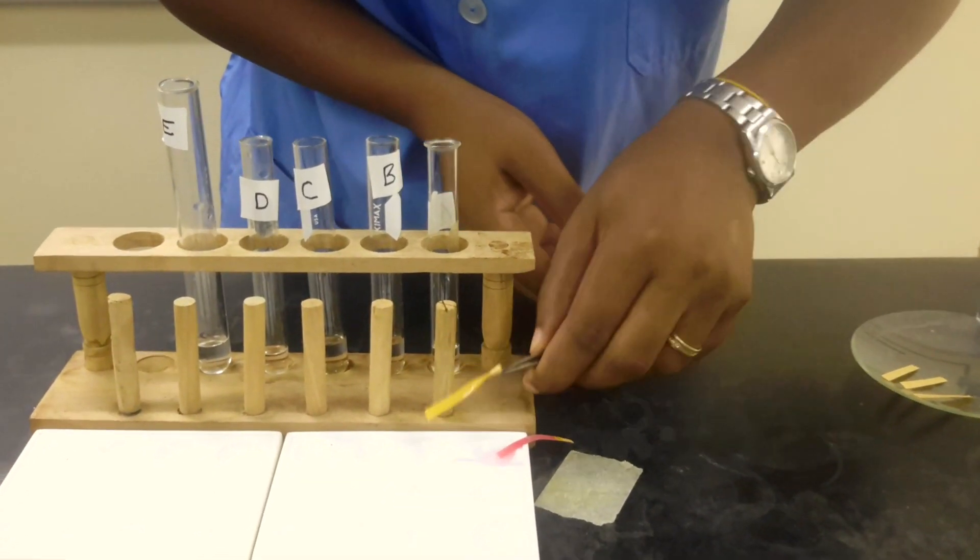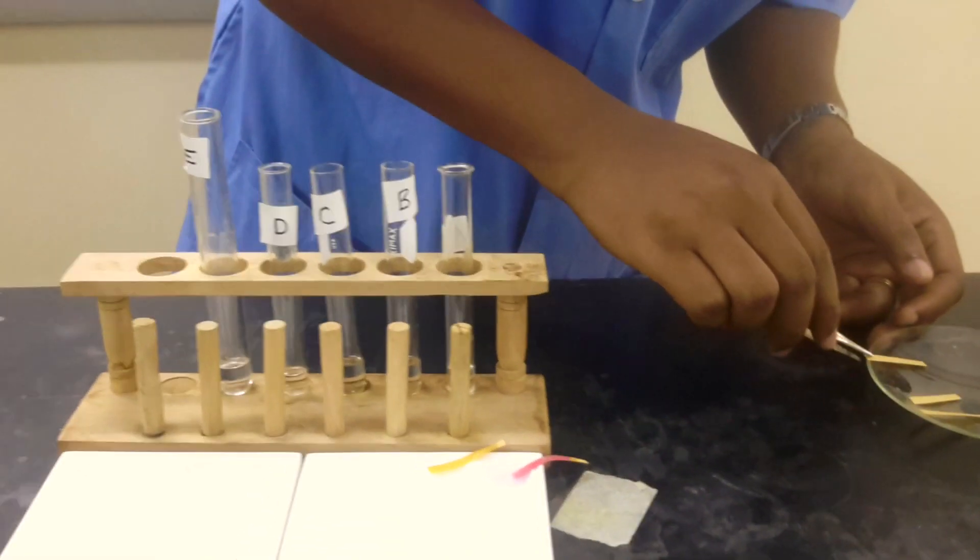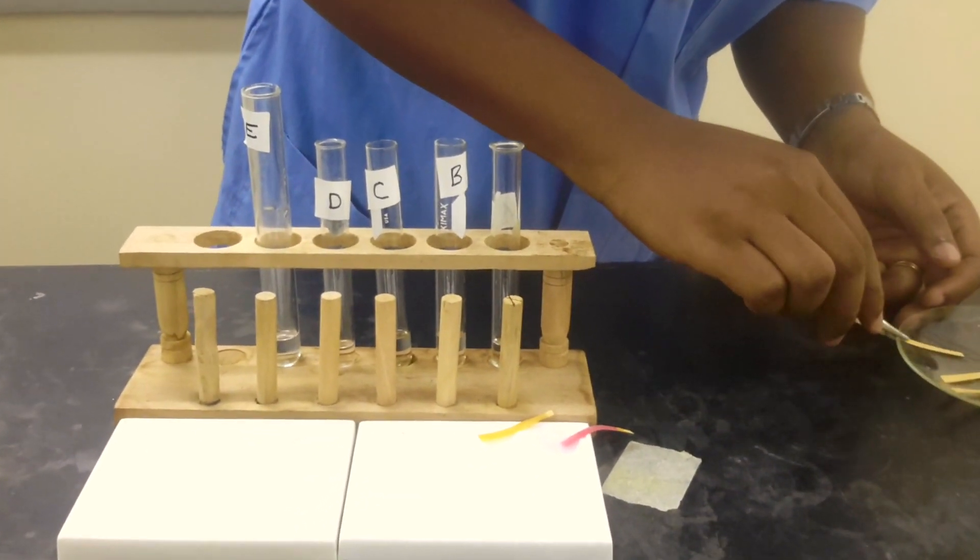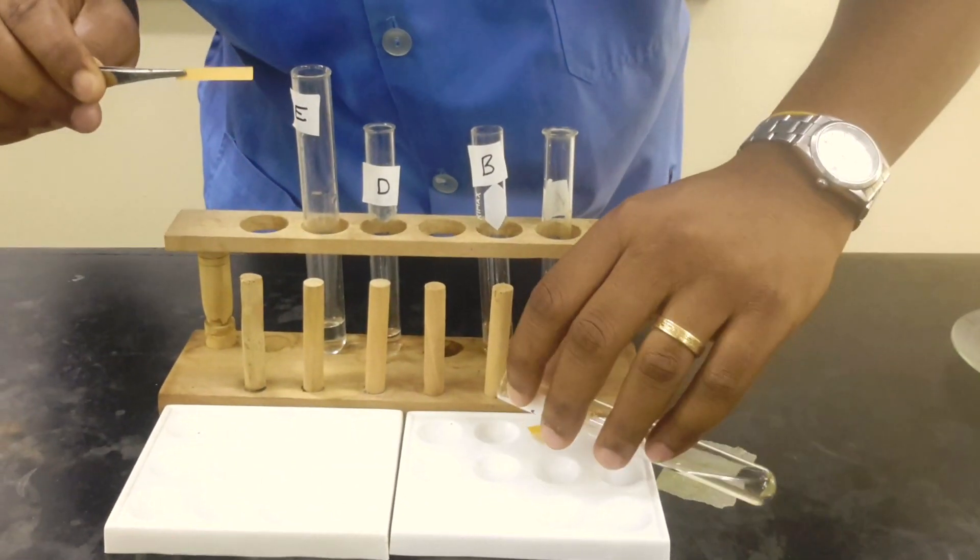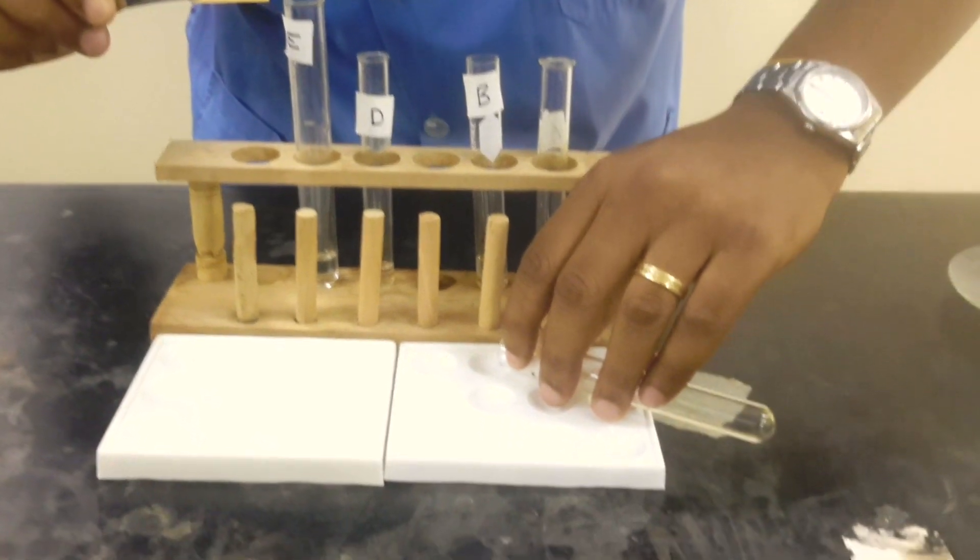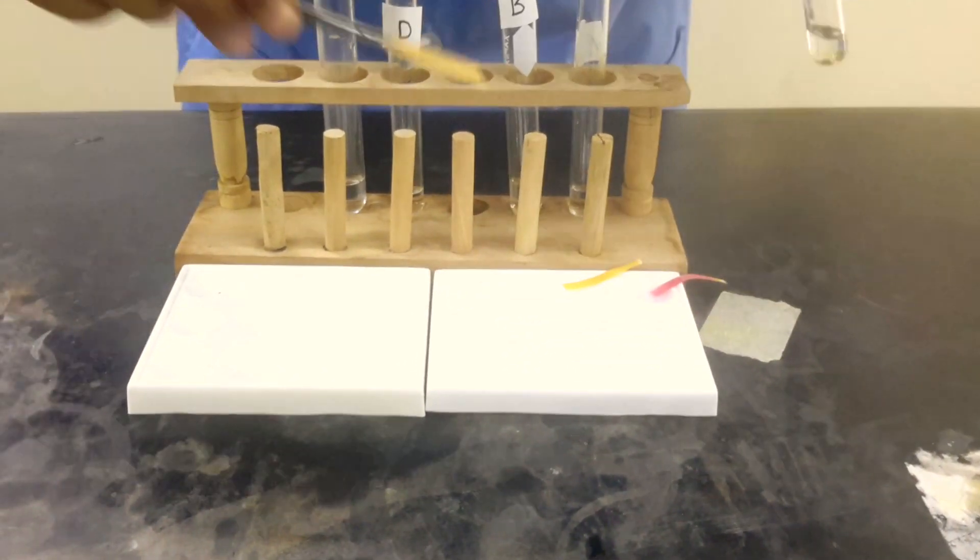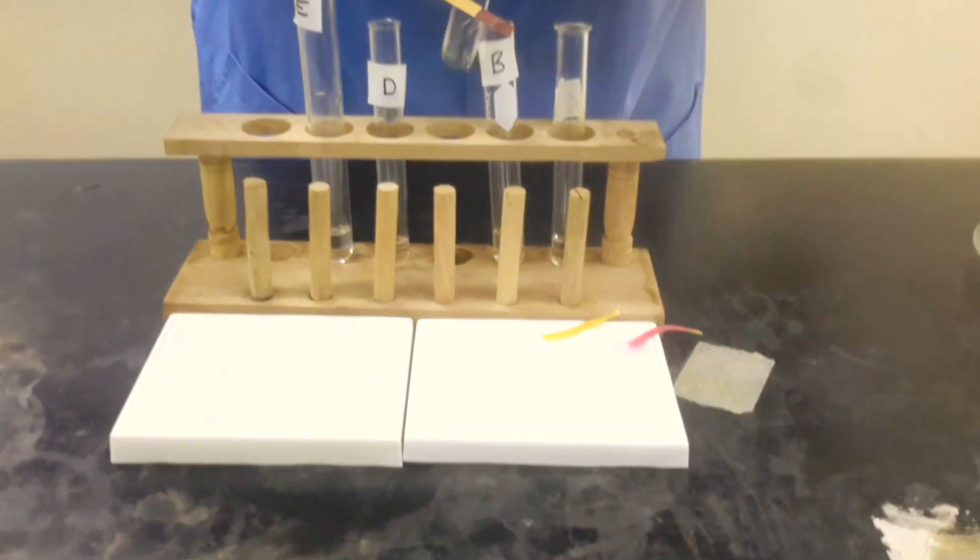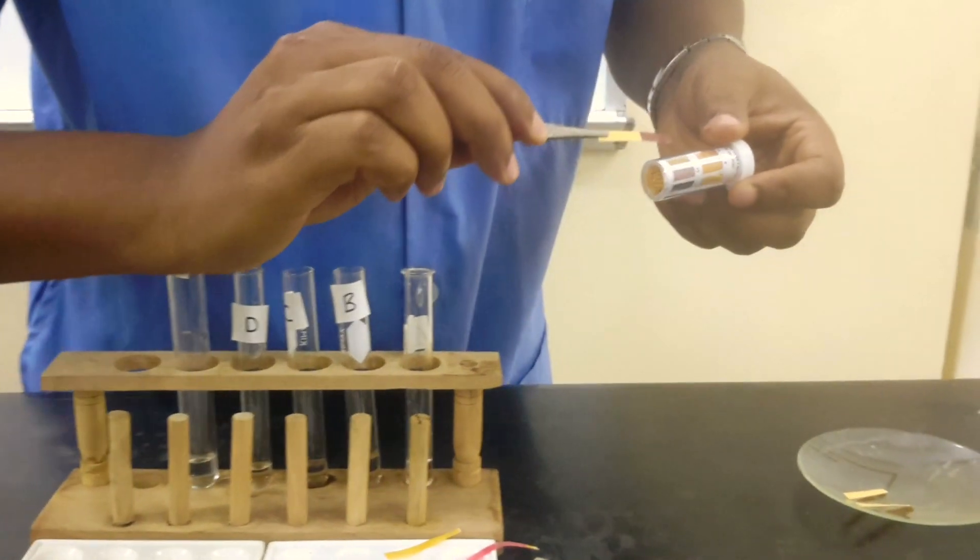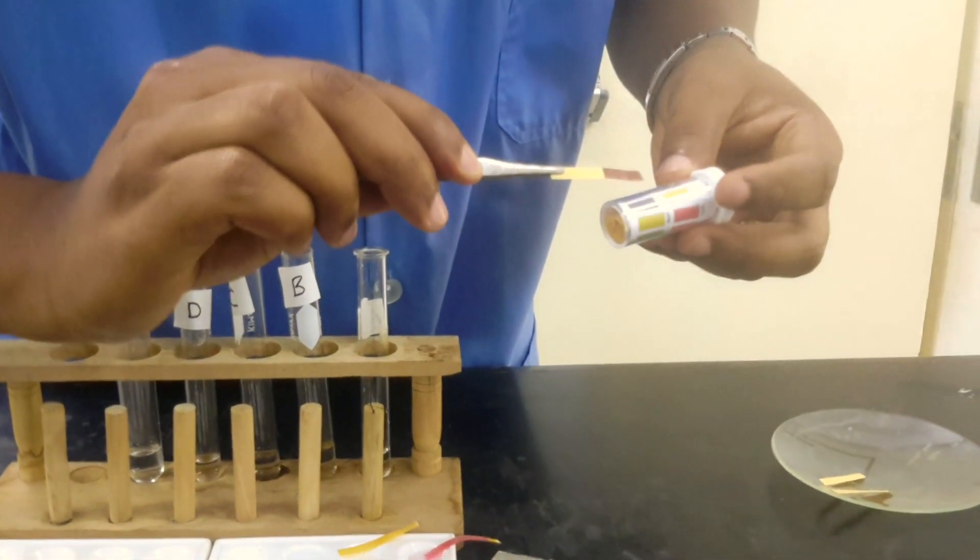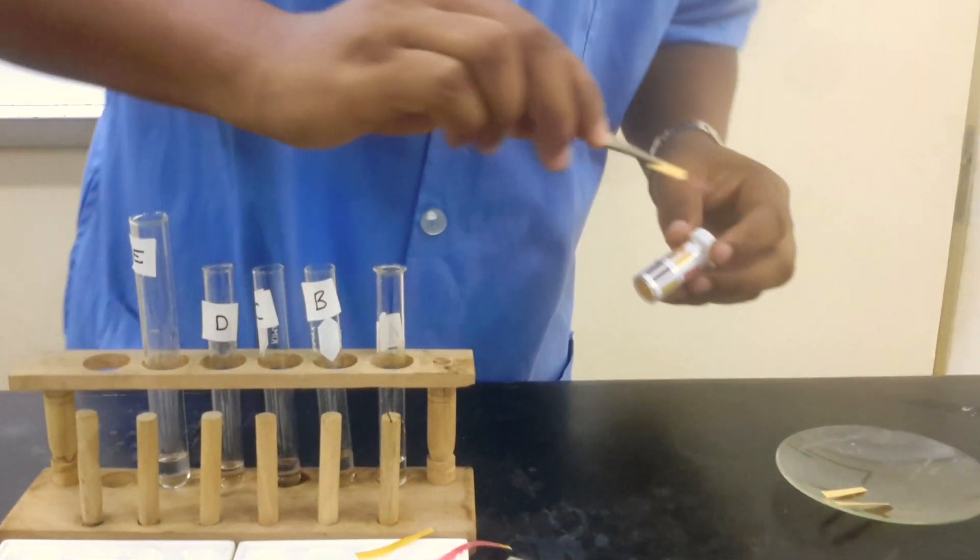We're going to do the same thing with C. Just to speed things up a bit, I could just pour a little of C into the spotting hole in the spotting tile, and I could just dip the strip into the solution, and then we'll do the usual match. This looks like pH 3.